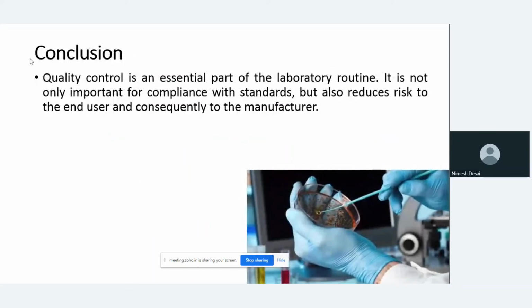So this is about the role and responsibility of the microbiology laboratory in the pharmaceutical industries. In brief, there are a few techniques available, and by using these few techniques we perform many tests. The techniques are common for all the tests, so we need to follow them with precautions. Microbiological testing is a 100% manual analysis, so we need to follow many aseptic practices.